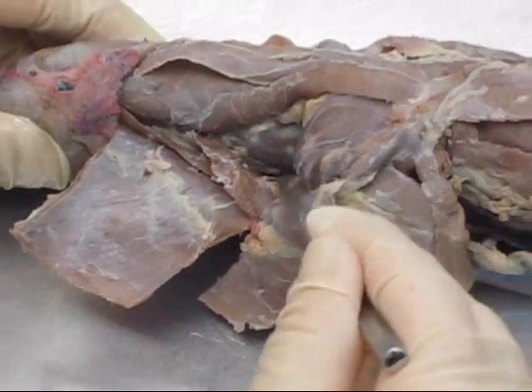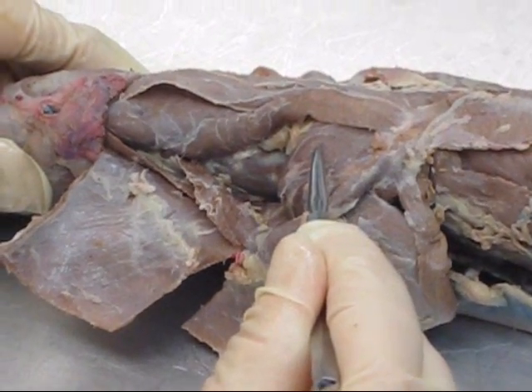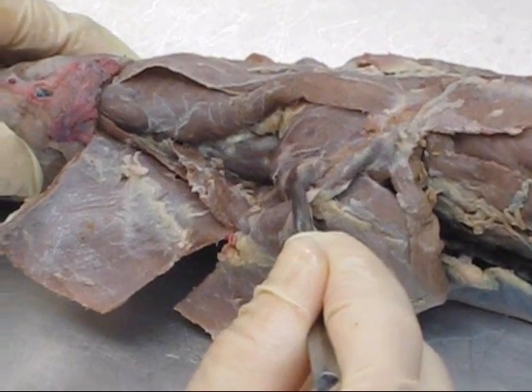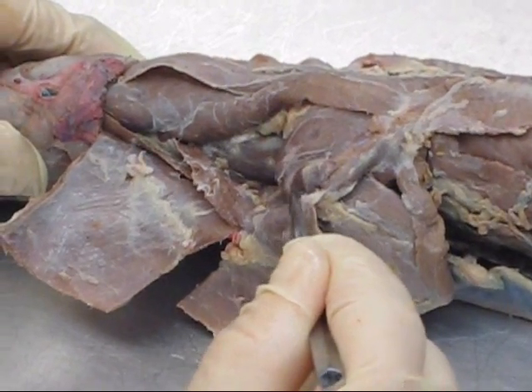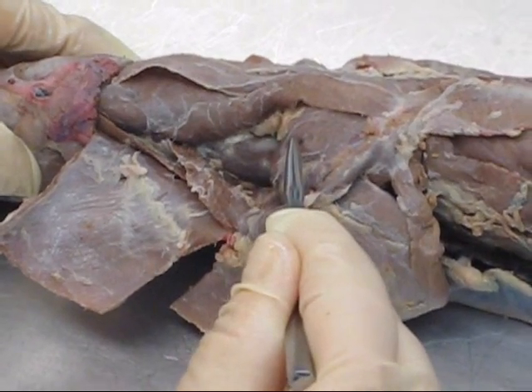Two muscles in the mink's shoulder region. One is a rotator cuff muscle — this is supraspinatus, right at the very tip of the shoulder. This is acromiodeltoid — the little muscle at the very tip is acromiodeltoid, and the much bigger muscle is supraspinatus.